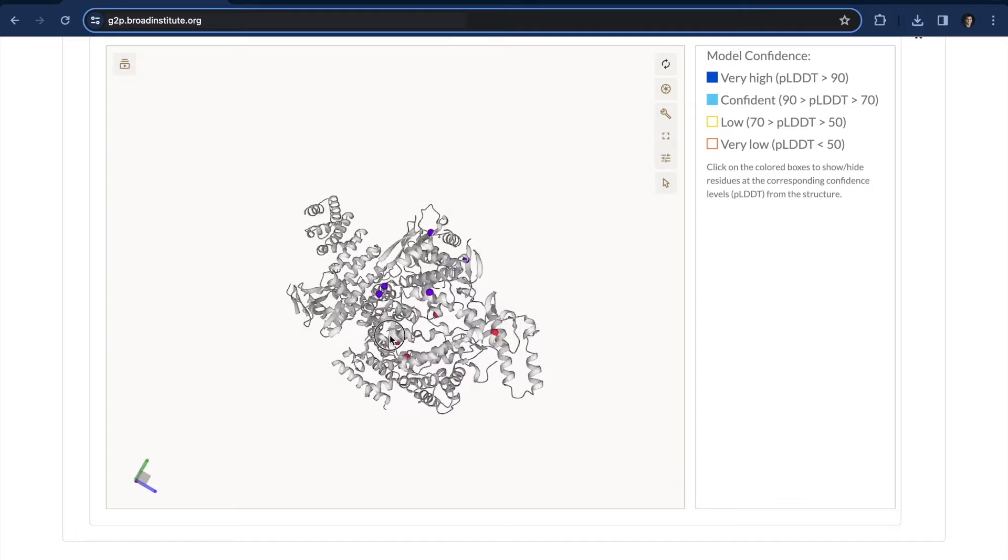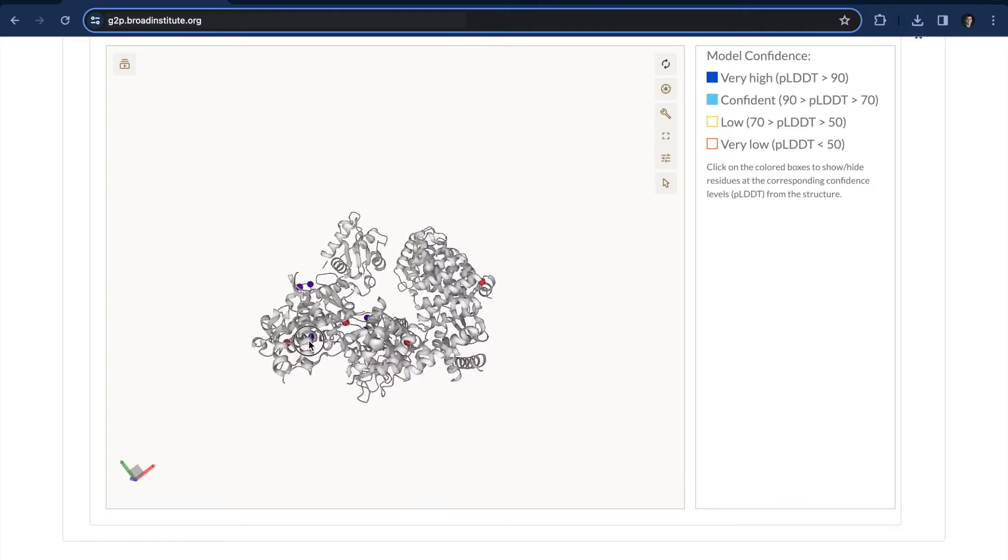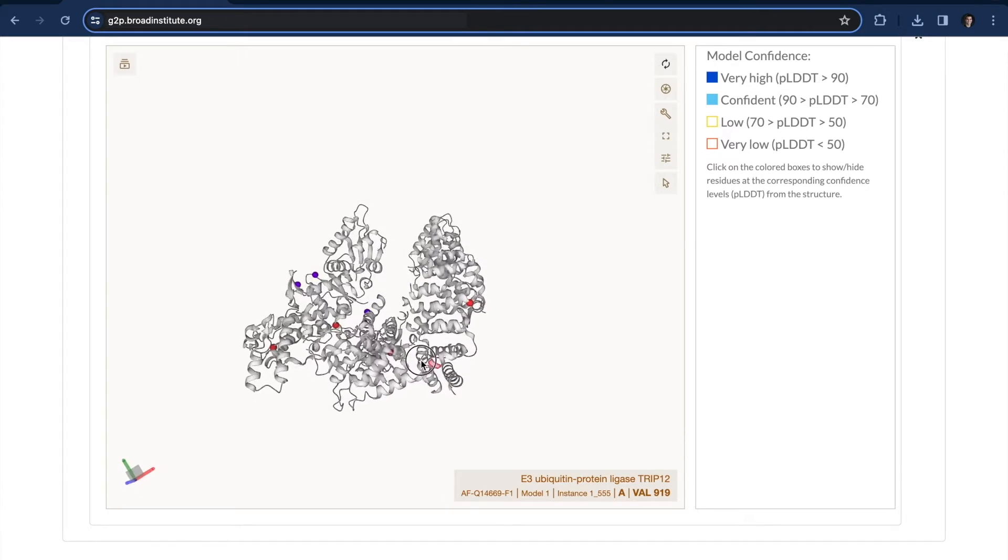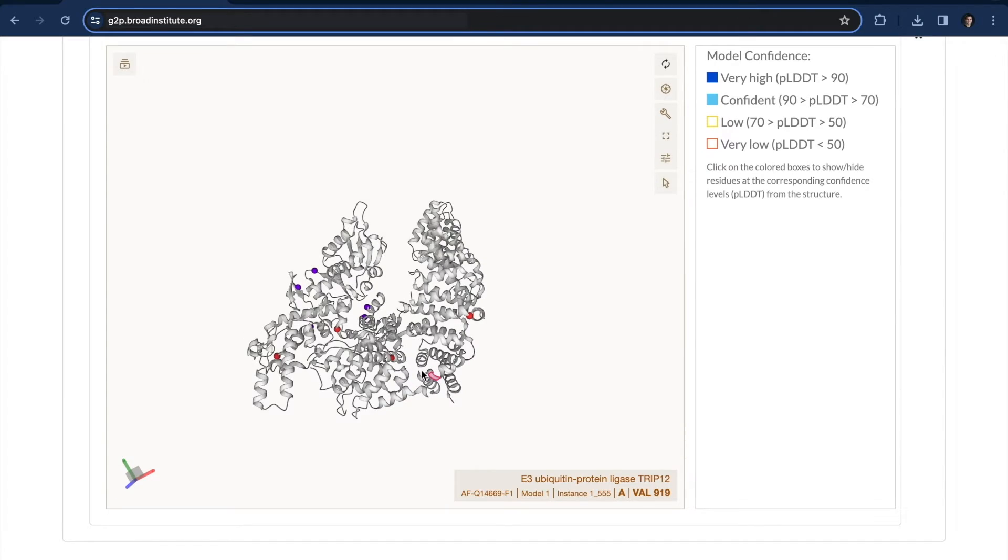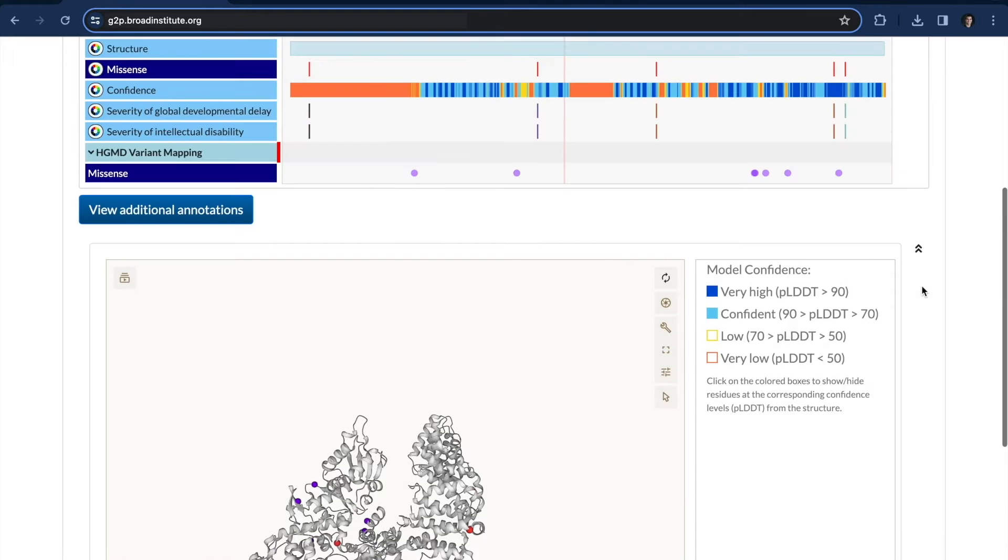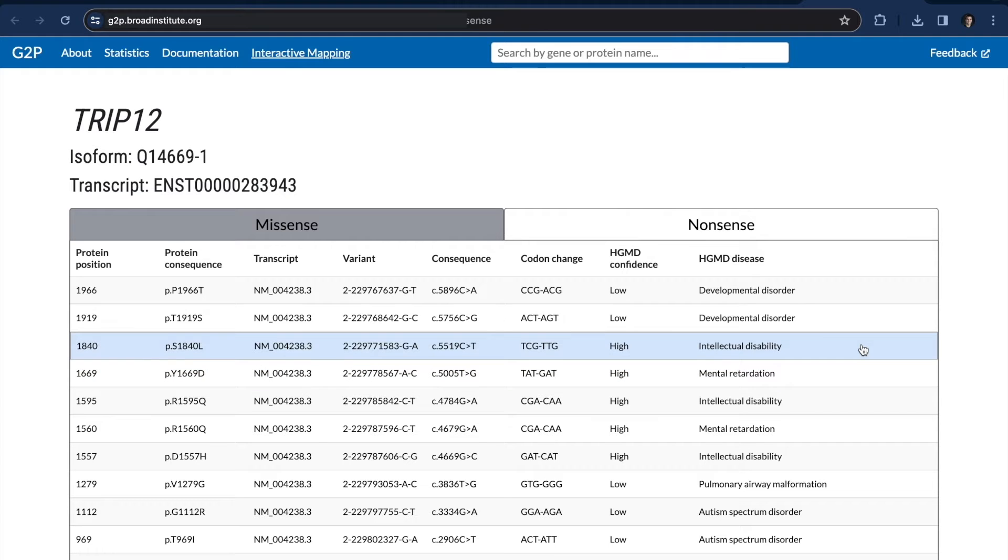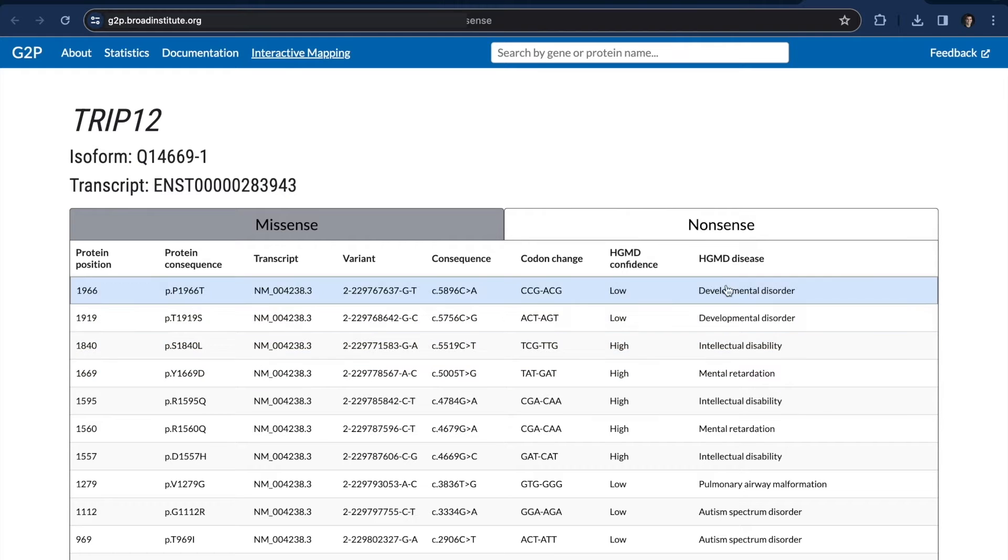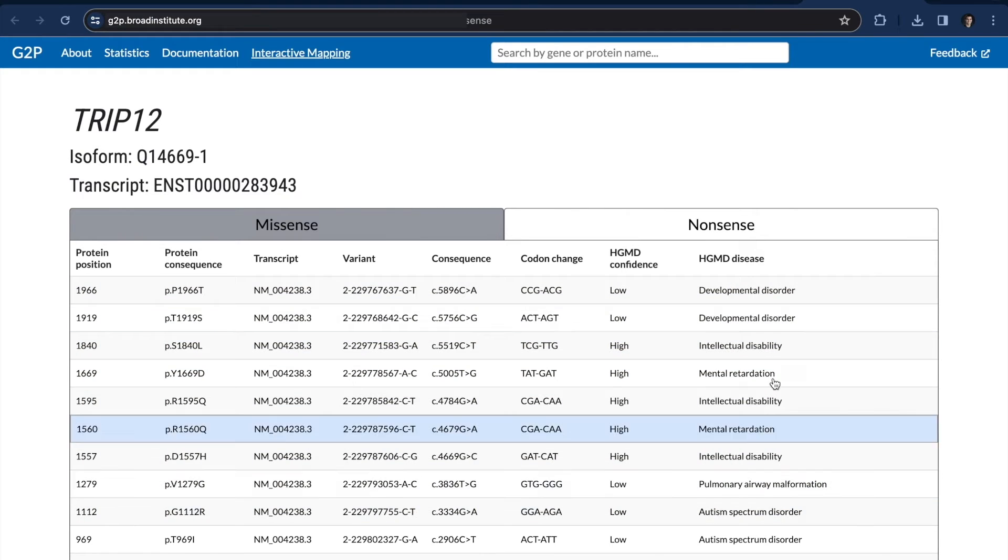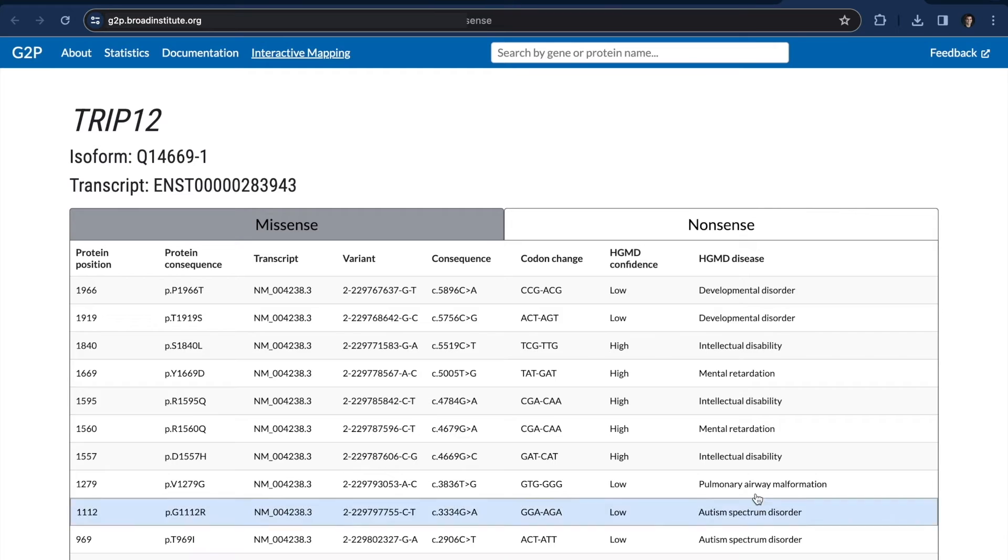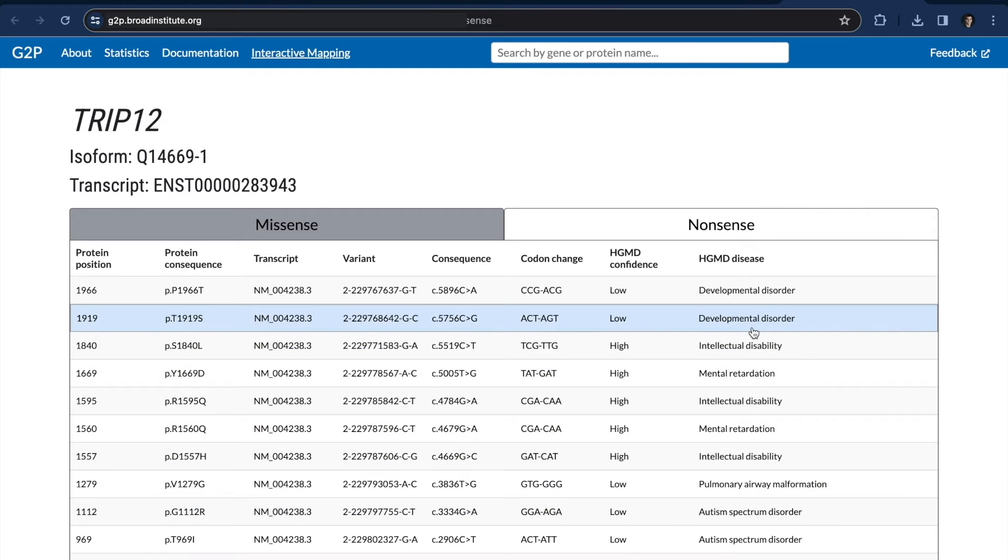For some reason, all of the new mutations from the paper are showing up in a different area than the existing HGMD mutations. Although the structural positions of the newly reported mutations are distinct from the HGMD mutations, do they share any common features? We will explore.